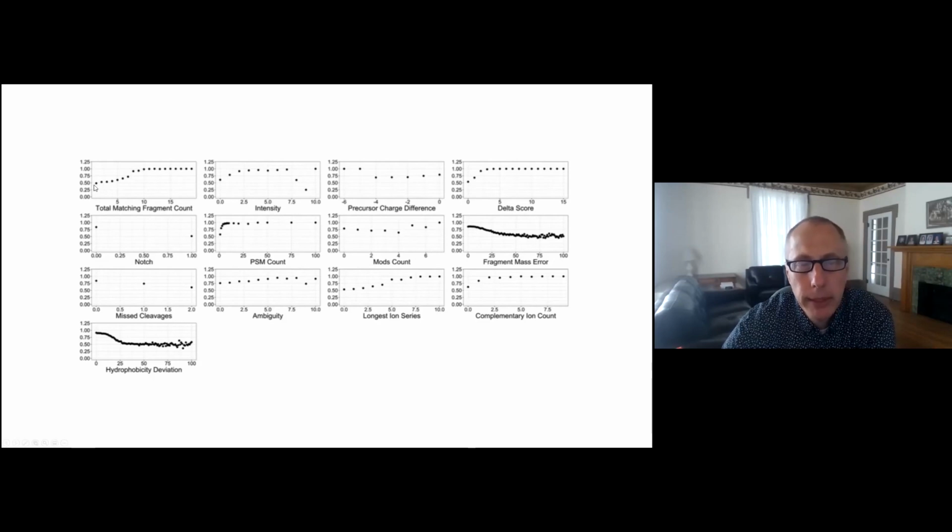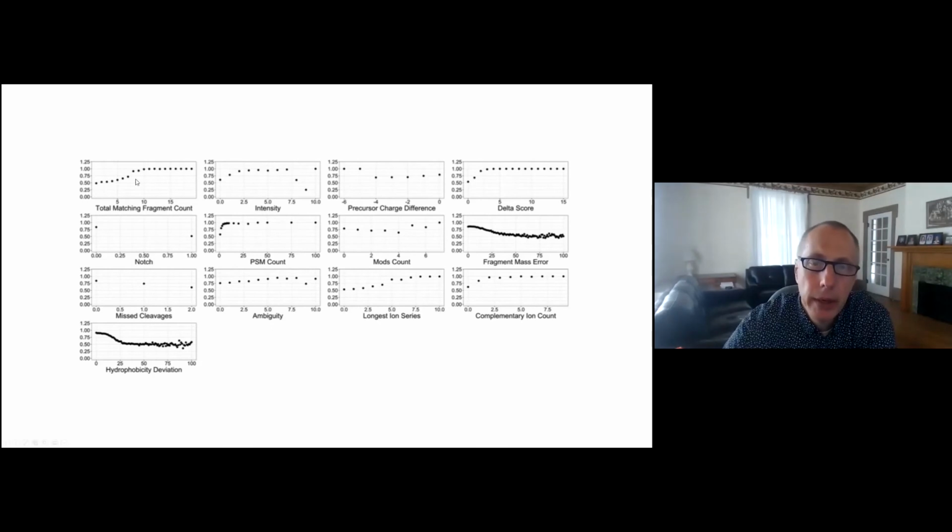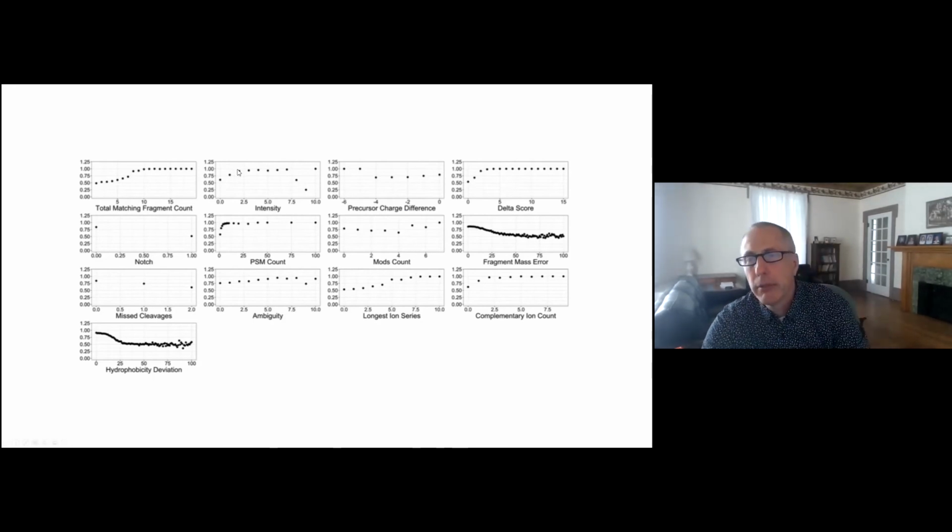And at the bottom, as you can imagine, it's going to be 50-50 because that's our criteria for target and decoy. This intensity is the fraction of matched spectrum intensity, not the MS1 peak intensity. You can see once you get up to this value of intensity, almost all things are targets. The reason it gets weird at the end is simply because there's a tiny number of random examples with those values. This is not a histogram based on abundance. It's just based on the fraction of things appearing at a certain value.